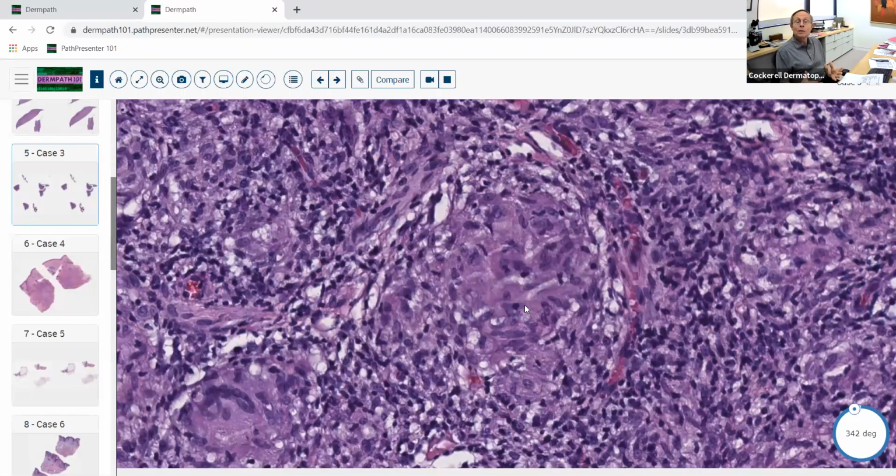One of the most classic ones is tuberculoid leprosy, tuberculoid Hansen's disease. Again, you think, well, if it's tuberculoid, it's going to give you a tuberculoid granulomatous inflammation, which means caseation degeneration of the granulomatous inflammation and also the collagen in the center of the granuloma. It's not really palisaded. But no, it actually gives you a sarcoidal histologic pattern. So tuberculoid Hansen's gives sarcoidal granulomatous inflammation that's usually elongated and goes along where the nerves are present in the skin. It goes along the neurovascular bundles.